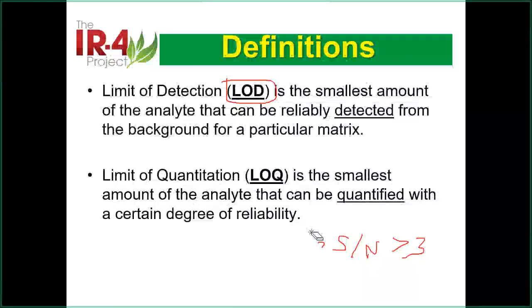So LOQ now is something about the amount. The LOD is about the instrument detection, the sensitivity. So this one is how much you can quantify. Now, this one is typically for people, LOQ is the amount. A lot of people say, okay, I add something to it, you give me the answer. But a lot of them is just simply, okay, I can do a statistical calculation.